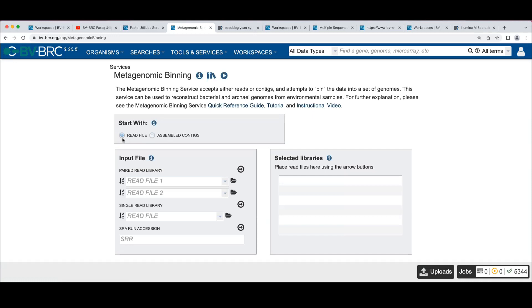We start out by choosing whether we're going to use reads or assembled contigs. You can come into this if you've already assembled your reads for some other project or using your own assembler. We're going to start with reads here.